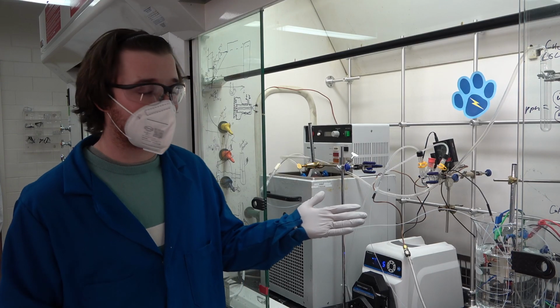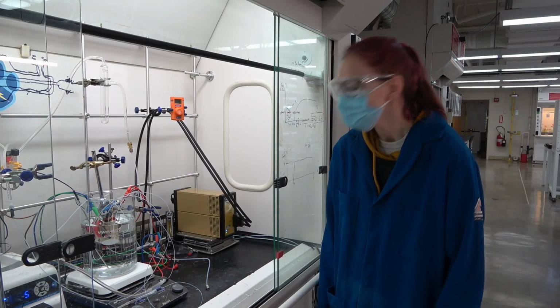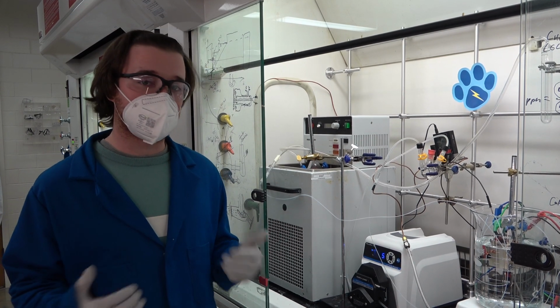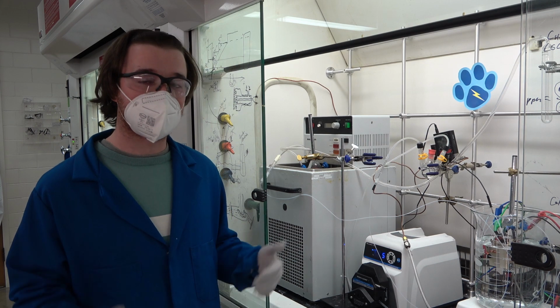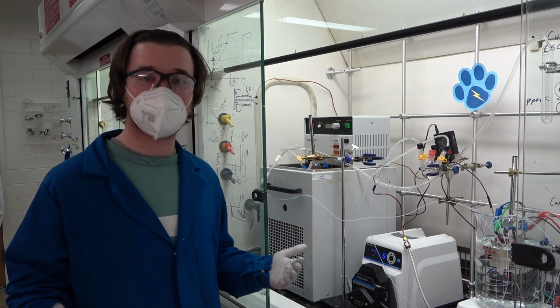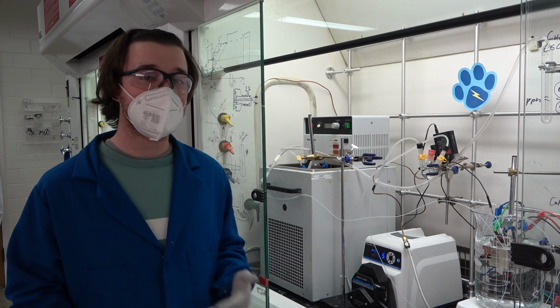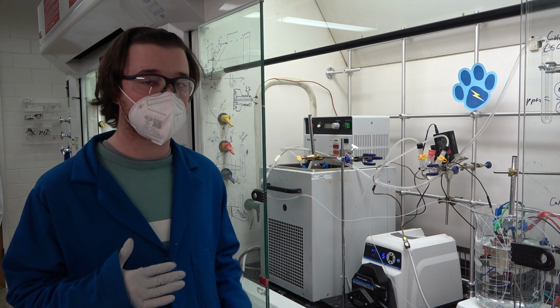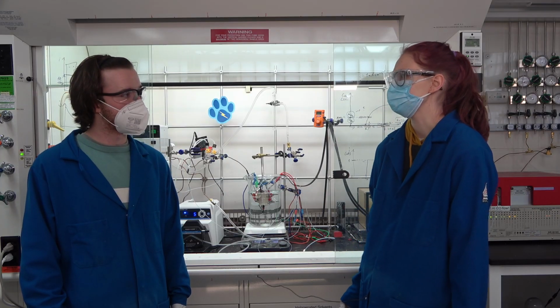So this is a type of reaction in here called electrochemical reduction of CO2. That's so cool. What's that used for? Yeah, the electrochemical reduction of carbon dioxide is really useful to combat the rising CO2 concentrations in our atmosphere, as it allows us to electrochemically transform the CO2 into fuels like methane and feedstock chemicals like ethylene. This simultaneously allows us to replace the current fossil fuel processes that you're used to make these same fuels and feedstock chemicals currently. That's such a good idea.